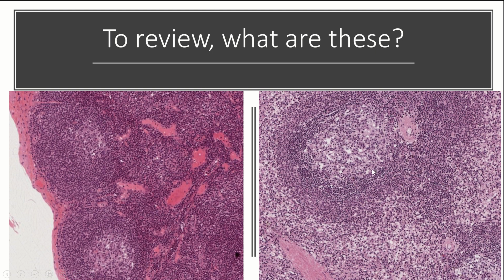So hopefully you're thinking maybe this is the spleen. And again, remember, this is why I said this is so confusing, because you can look at this and say, hey, this looks a lot like this does, right? But this is not a follicle with a germinal center. This is white pulp, okay? Another way to know is it's not towards the edge of the organ. It does kind of look different, so it just takes practice. I can look at these really easily and tell you what organ it's in. It takes practice, just the way that they orient themselves, okay?